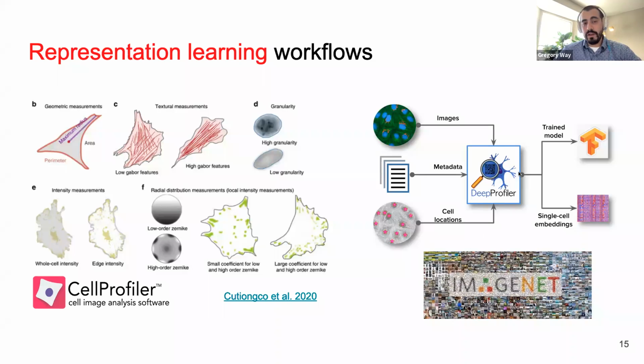Typically what we do in Deep Profiler, or at least what I've seen done in Deep Profiler, is that there is often a resolution change. If you're analyzing two different data sets and one has a higher magnification than the other, I have seen downsampling to make sure that they're on the same resolution. So I suspect that the features that you identify are going to be different depending on the resolution, and you probably want to keep it consistent. But to the extent that they're transferable, I think it's still unknown. Cool. Thank you.